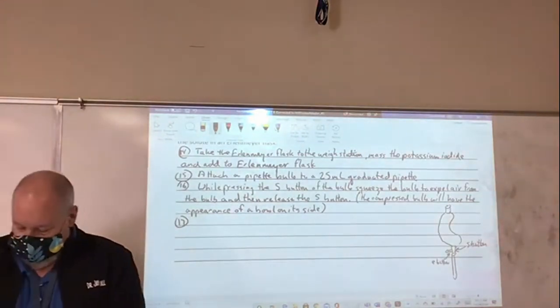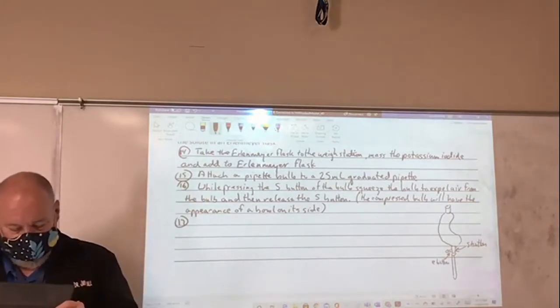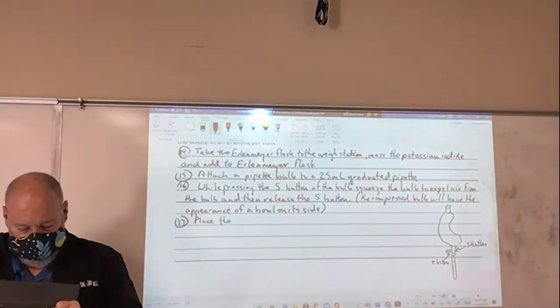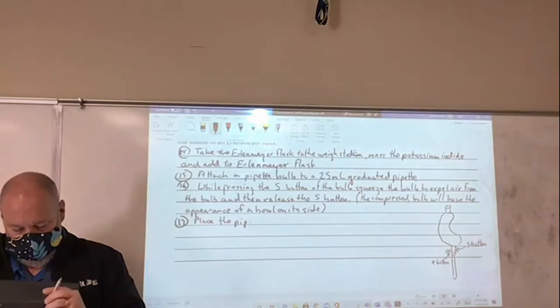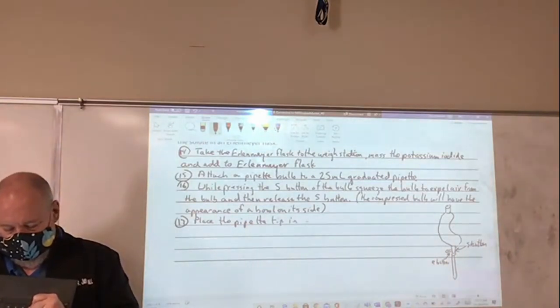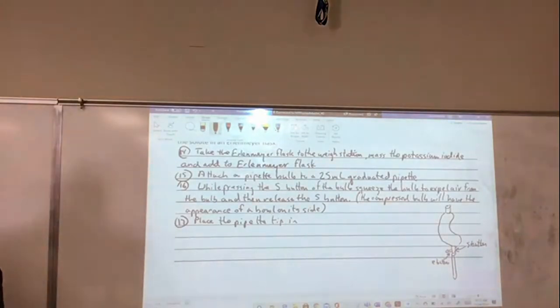Okay? So we're going to add, so place the pipette tip in, so here's where Kenzie's idea might have been a good thing.